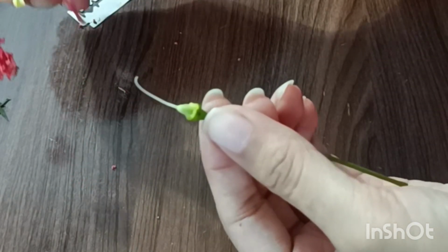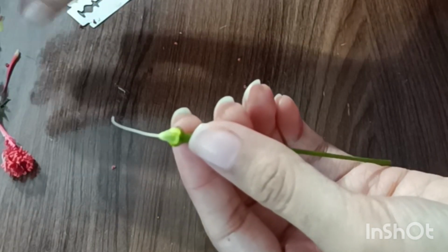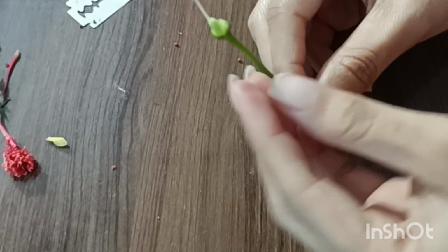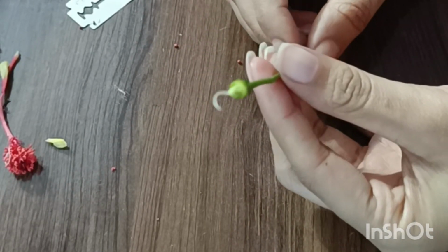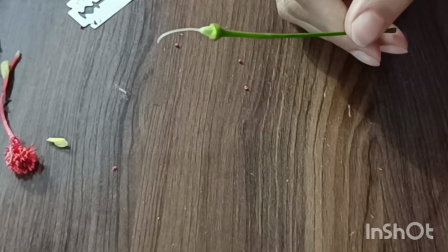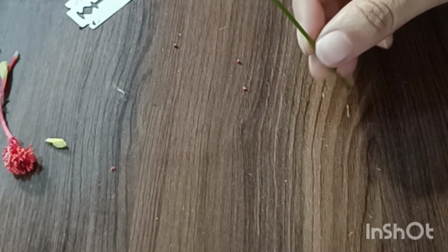Thus, by dissecting the hibiscus flower, I studied all its floral parts including epicalyx, calyx, corolla, androecium and gynoecium. Hence, the hibiscus flower belongs to the family Malvaceae.